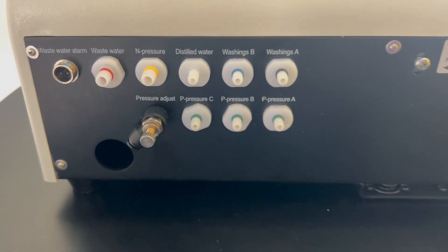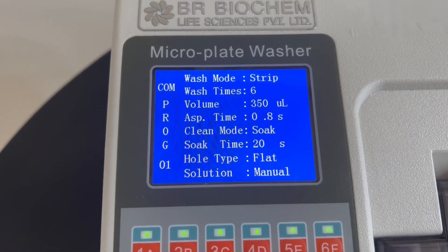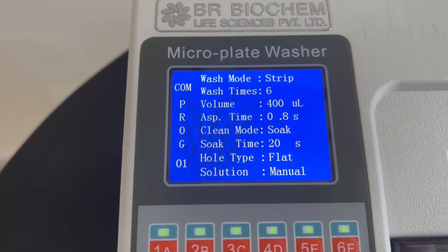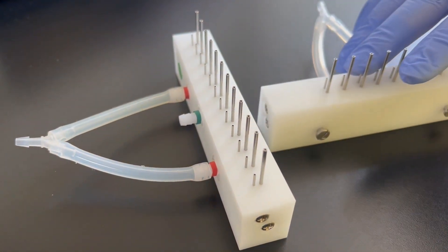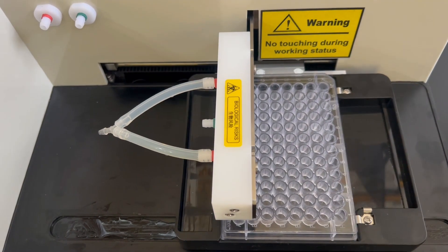Now, let's delve into the specifications. Our plate washer supports various plate models, including flat, round, U, and V-plates in both 96-well and 48-well formats. Manifold types: choose between 8-way and 12-way manifolds, providing flexibility and adaptability for different experimental setups.